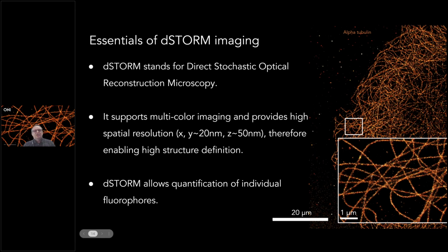One of the other advantages of this technology is that it also allows quantification of individual LNPs. You will not get the perfect number of copies of your receptors or ligand on the surface of lipid nanoparticles. However, if you are comparing between different conditions, such as tuning the amount of PEG molecules on the surface of lipid nanoparticles, you are able to get information on whether adding more PEG molecules to your lipid nanoparticle composition is actually increasing the number of PEG molecules per lipid nanoparticle or not.